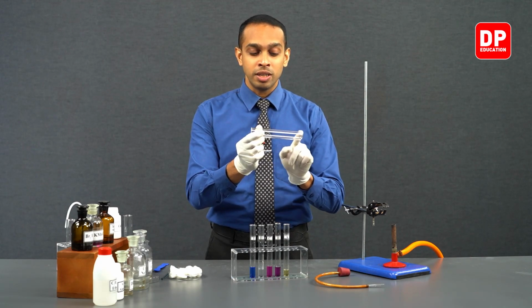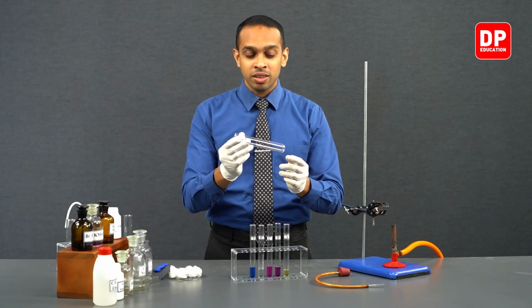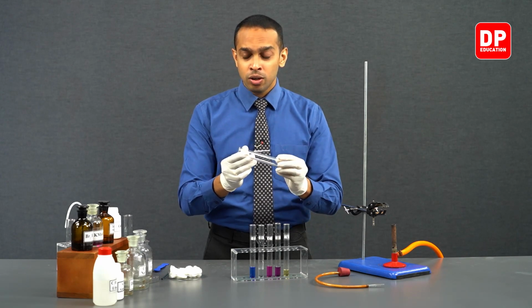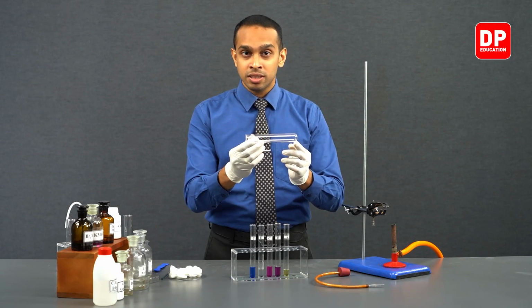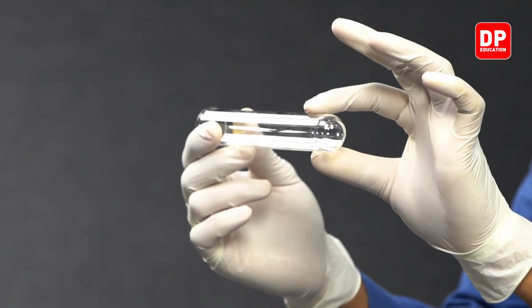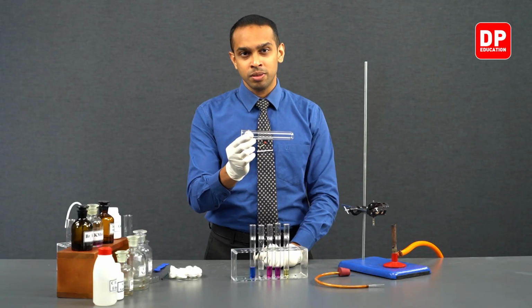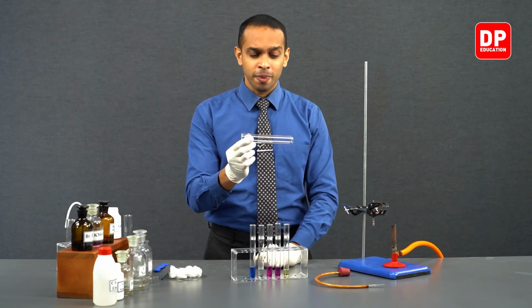tube. So the reason for us to introduce our cotton wool is to make sure that the ethanol doesn't flow over the alumina that we have here. Cotton wool will absorb the ethanol, and when we turn this boiling tube horizontal like this, ethanol will not flow towards our alumina that we have in the middle of the boiling tube. That is the reason for us to add our cotton wool.